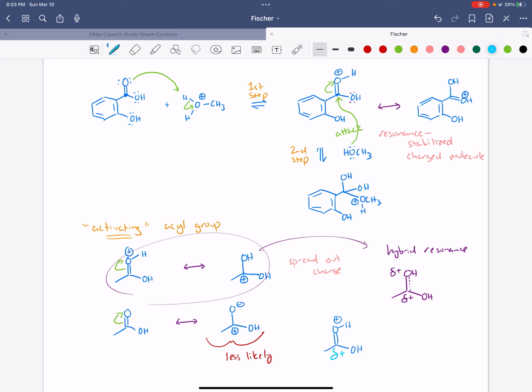For instance, in lecture we've been talking a little bit about hydrogenation of oil, partially hydrogenated oils. Well, there's metal in there. That's metal hydrogenation. You have to purify out the metal, or else you're going to poison your consumers. So here we're going to talk about acid-base extraction to purify compounds.